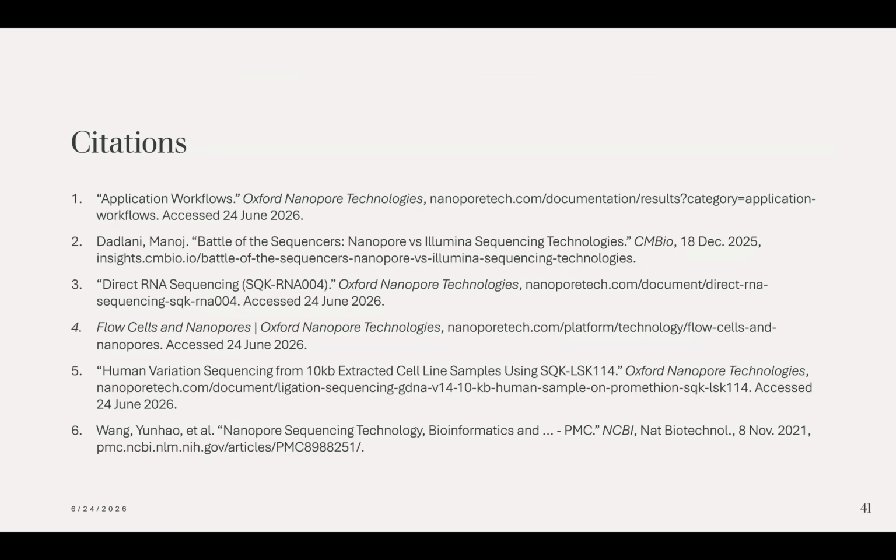Can you just comment on how much DNA you need to start with? And how many samples you can prepare in a time? I don't know if you do large numbers at once, but what would be a practical number of samples?